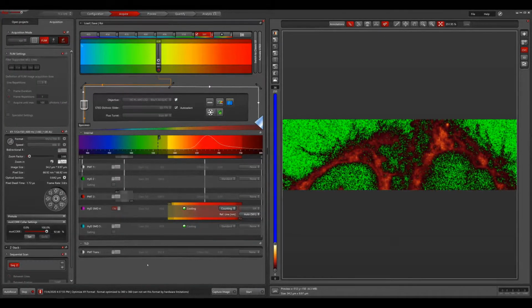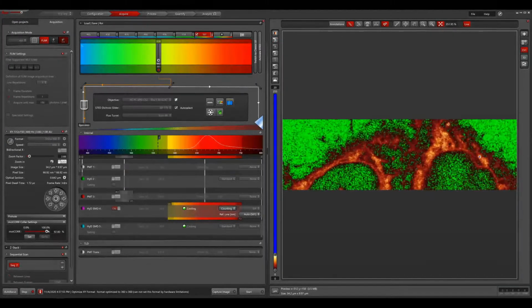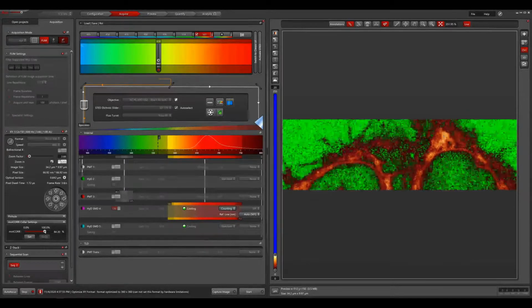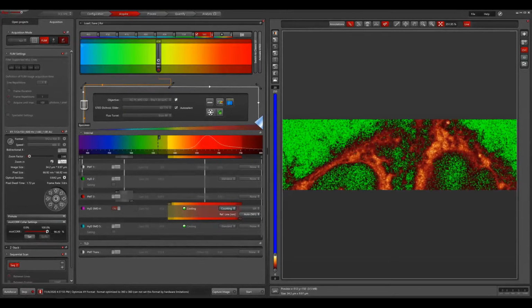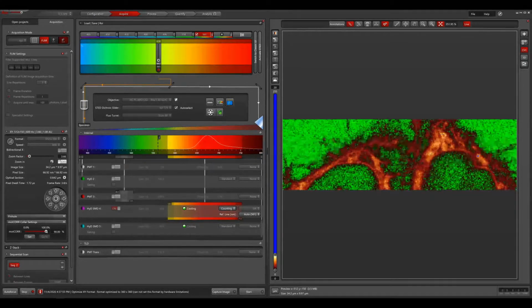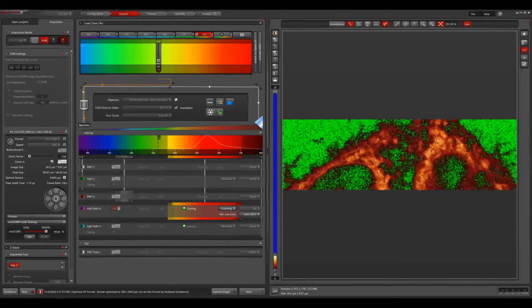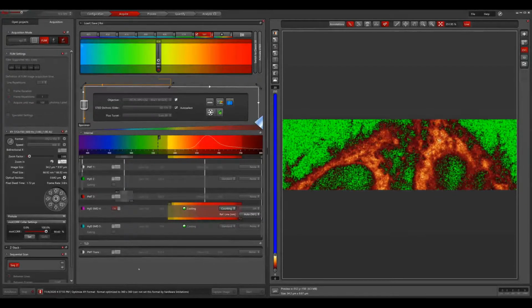and which will then allow us to optimally adjust it to our sample. So I will go back in a live scan here. If you are changing the slider over here, which is what I'm doing now, then you can see that the image that we're getting is changing and also the intensity is changing. And what I'm looking for now is the setting which actually gives me the highest intensity at the end. So this is somewhere around here. So this is making sure now that we have optimally adjusted our objective and our optics of our Tau STED system to our sample. And I can simply do that, as I said, by choosing the setting which gives me the highest intensity, which at the same time is also the smallest point spread function and therefore the highest resolution.